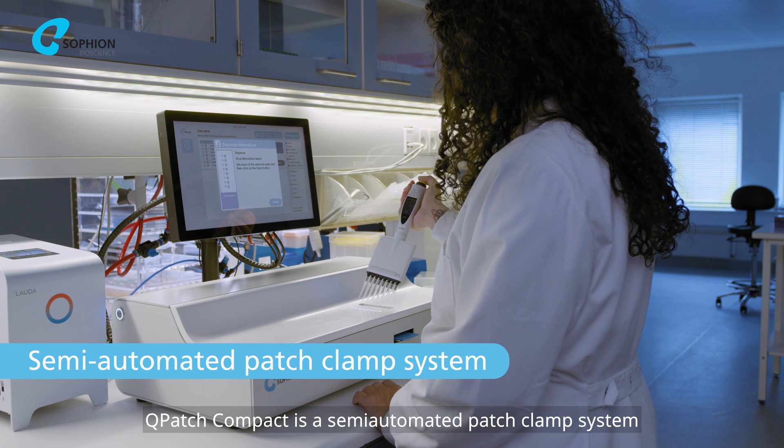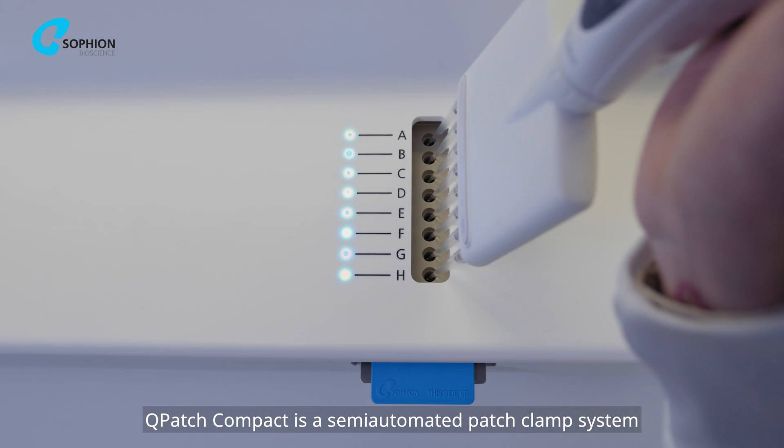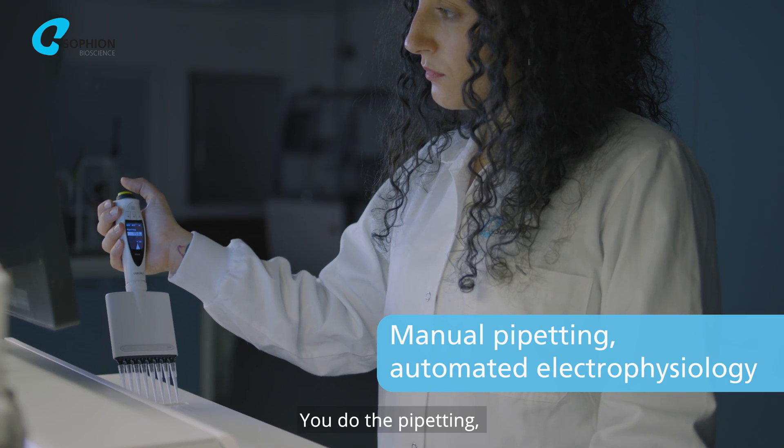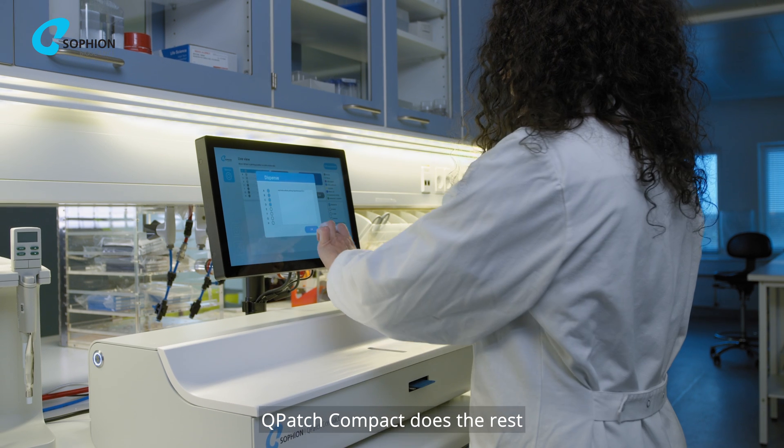Q-Patch Compact is a semi-automated patch clamp system that makes patch clamping accessible to anyone. You do the pipetting. Q-Patch Compact does the rest.